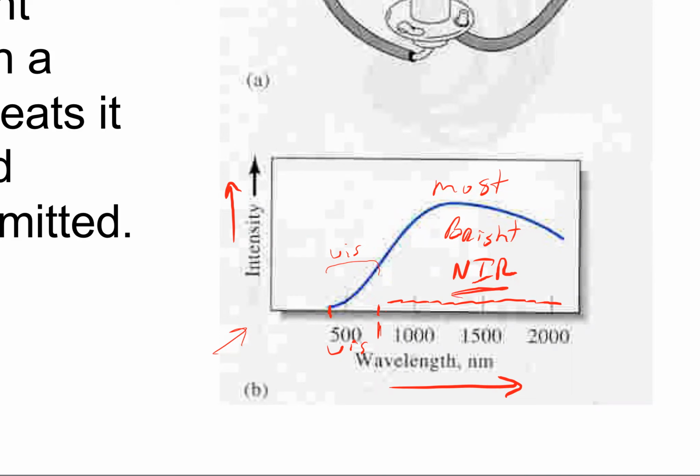In recent years, there's been a lot of talk and action towards replacing tungsten lamps in your homes for lighting applications, right? You might want to switch to fluorescent-based light or an LED-based light. And this is actually a big reason why: most of the light that these lamps give off is in the near infrared. We can't see that.